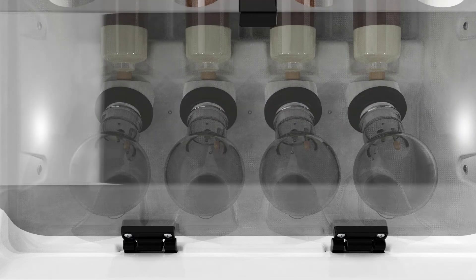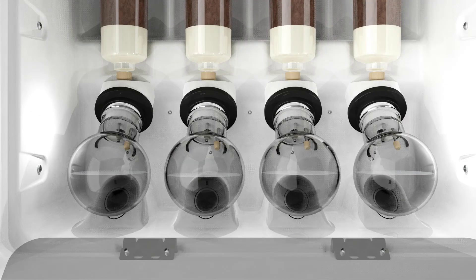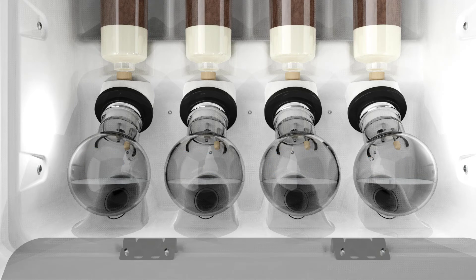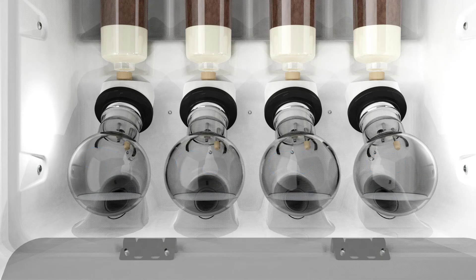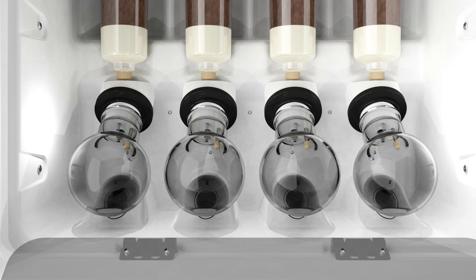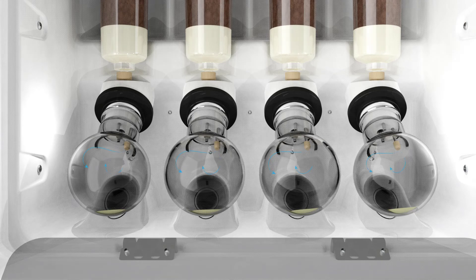Evaporation is optimized by an innovative design that increases the surface area of the solvent and counteracts evaporative cooling with directed heat input. These factors result in fast evaporation while continually maintaining an inert nitrogen environment.